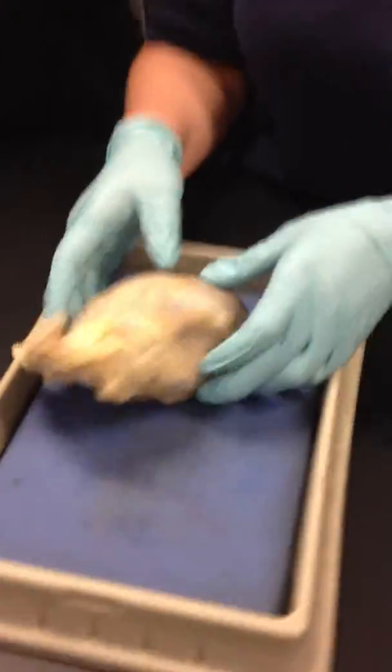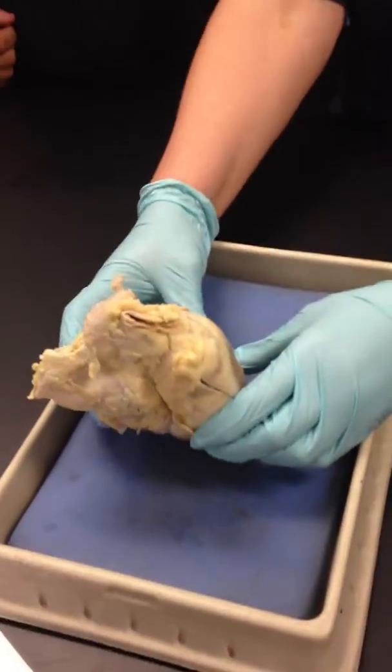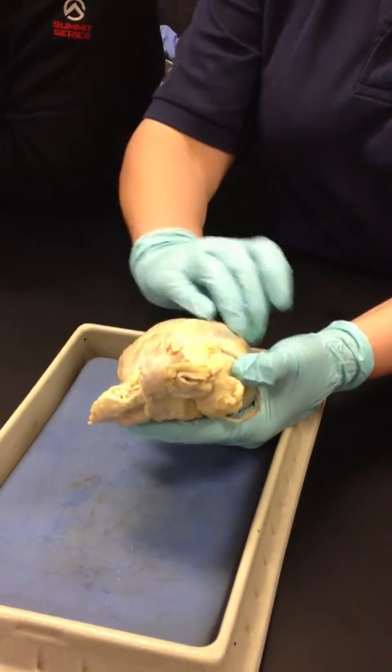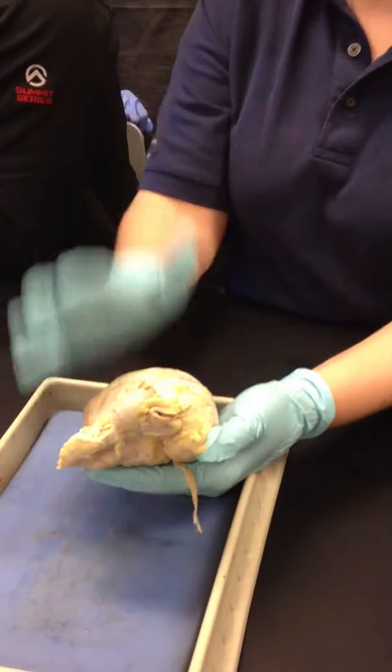Guys, first you have to orient it to where it is as if it was lying in somebody else's body. So it'd be like this for me if it was lying in my body, right? Of course, the apex is down here, and you're looking at this sulcus right here that's going to separate the right half from the left half.